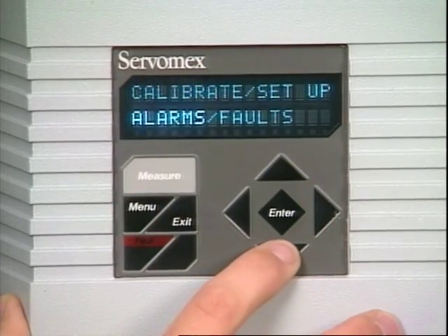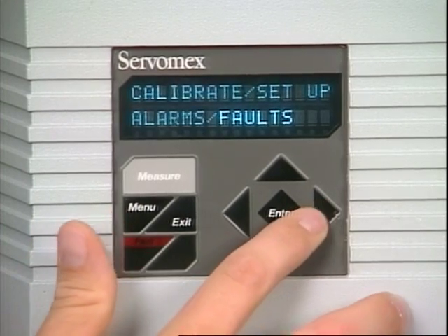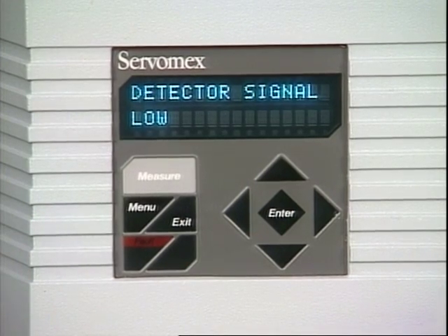Most newer analyzers may have self-diagnostics software that can greatly aid troubleshooting efforts by isolating the fault to the source, cell, detector, or the electronics portions of the analyzer. Consult the manufacturer's manual for further information about your specific analyzer.